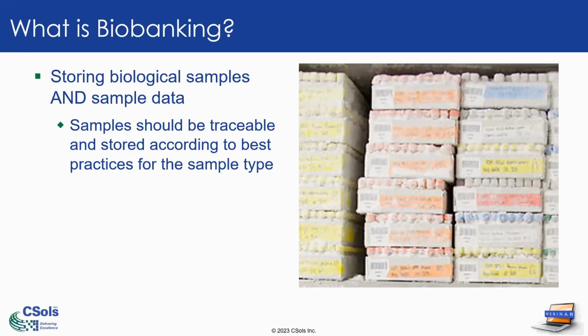So what is biobanking? Biobanking is the storage or banking of biological samples. Sounds pretty simple up front, but maybe when you start with like 1 box in a freezer, that seems easy, but then you amplify that to a whole freezer full or an entire freezer farm full of boxes, full of freezers, just full of samples everywhere, and it gets complicated fast.